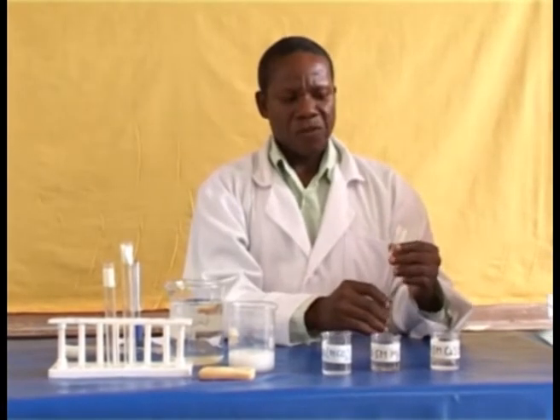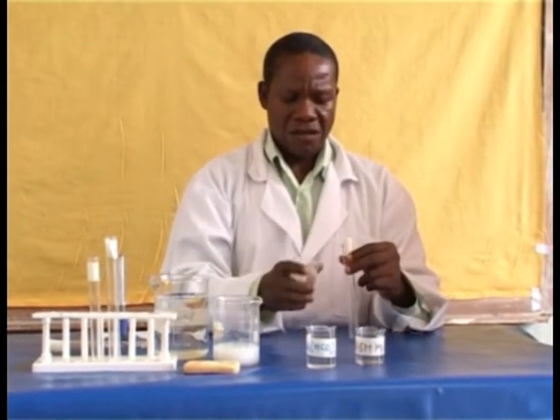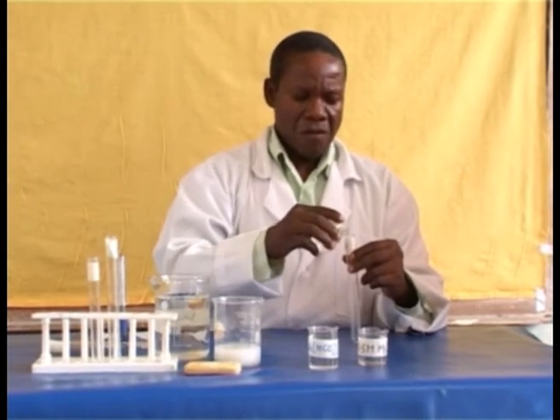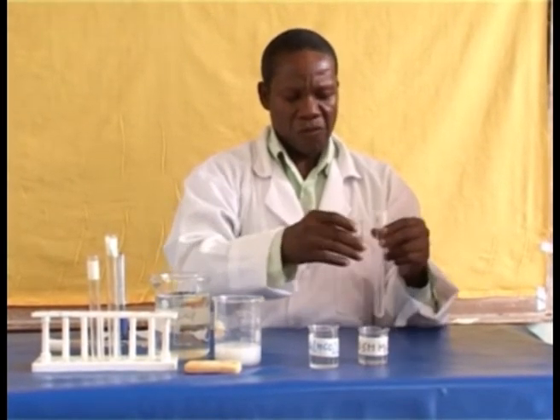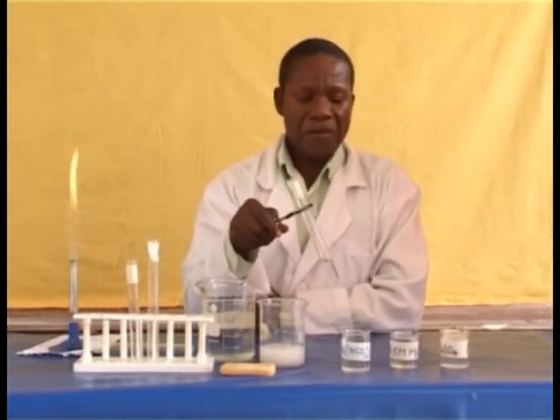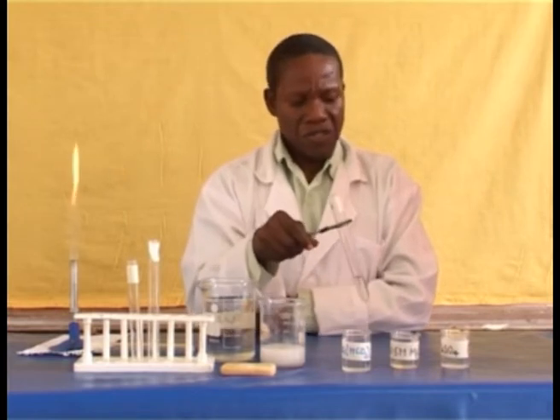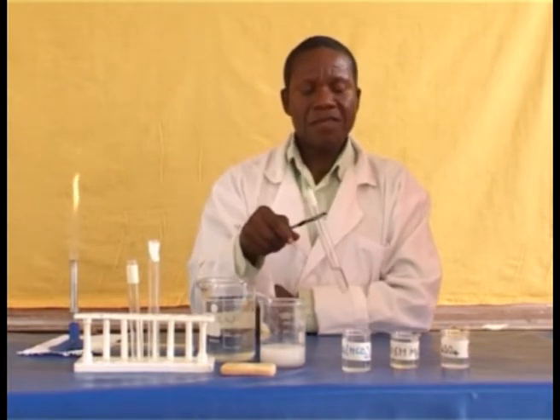Take test tube G, fill in an amount of the prepared calcium sulfate. In this experiment, after pouring the solution of calcium sulfate, boil it a little bit.